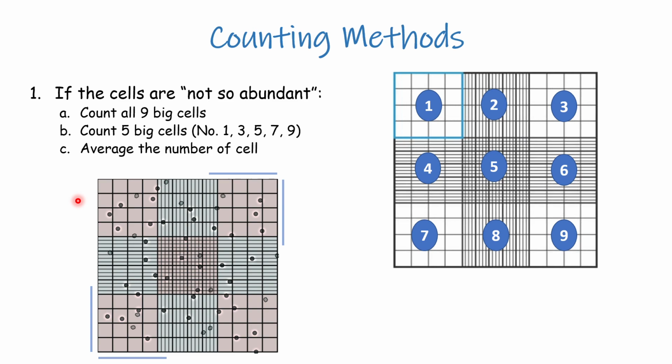But the thing that I want to emphasize here is that each lab has their own rule, and the rule is this. In my current lab, we count all the cells that are within one big cell, but we also count cells that are a little bit outside of this big cell, if and only if the cells still touch the lines above, right, below, and left.